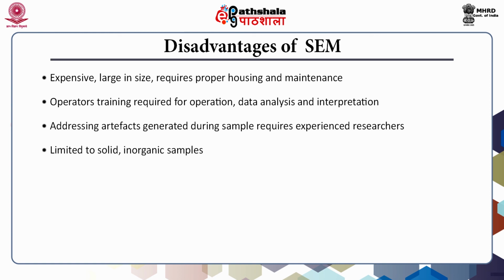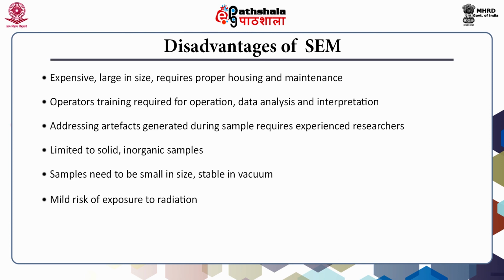The technique is limited to solid or inorganic samples. Samples have to be small enough to fit inside the vacuum chamber. Sample must be stable in vacuum and should be able to withstand vacuum pressure. There is a mild risk of exposure to radiation with electrons that have scattered from beneath the sample surface.